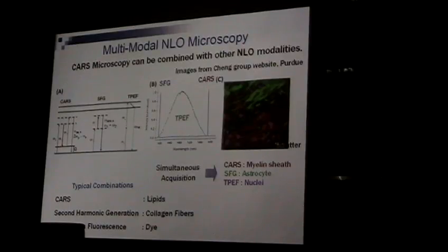So what they ended up with is, okay, fine. What they found instead is that CH can be a good marker. If somebody had asked me before I joined this business, I'm a chemist, what chemical selectivity do you have with CH? I would say, what are you talking about? CH is present everywhere. Every molecule has CH. So what chemical selectivity do you have?